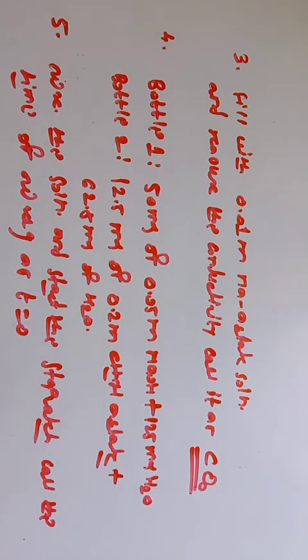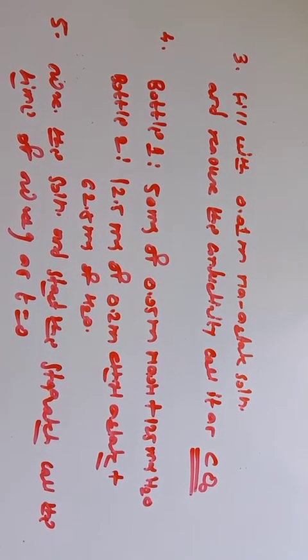When you mix these two bottles, consider that time as t0. Then fill the conductivity cell with the reaction mixture and stir it continuously.